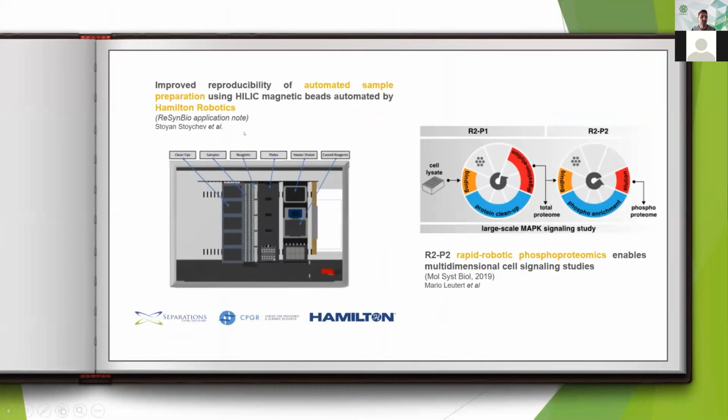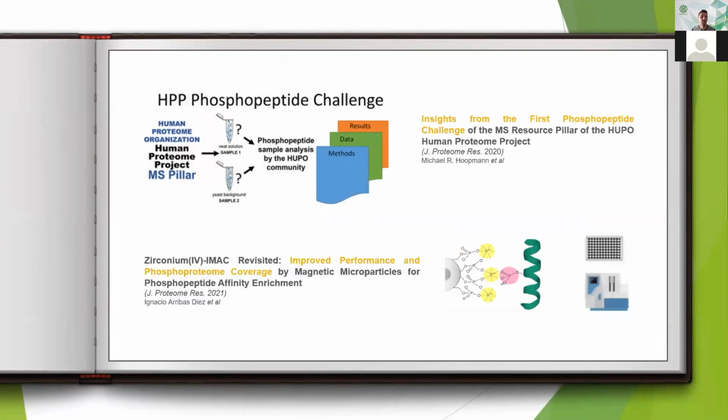We further highlighted the applicability of the workflows across different types of robotic and liquid handling stations. And again, through the inputs of the community and their lead, further functionality was added to these workflows in terms of the ability to automate them.